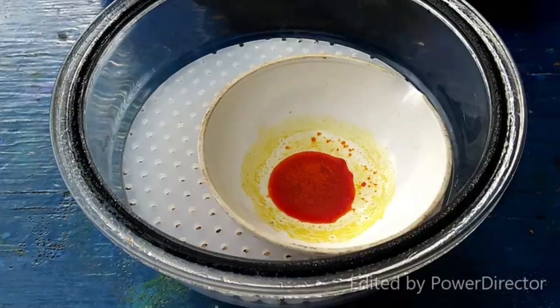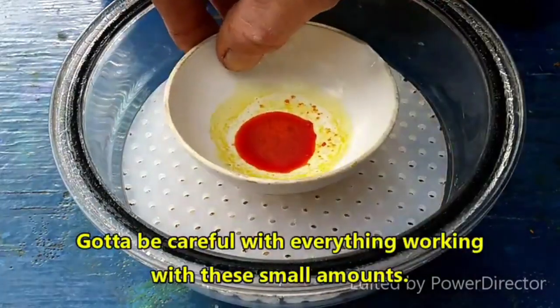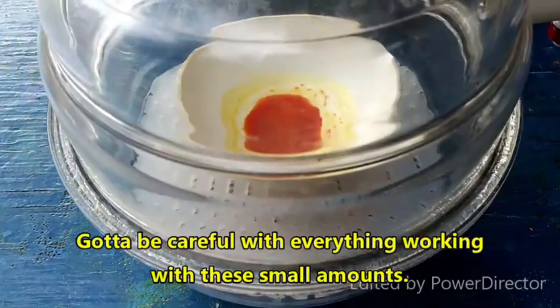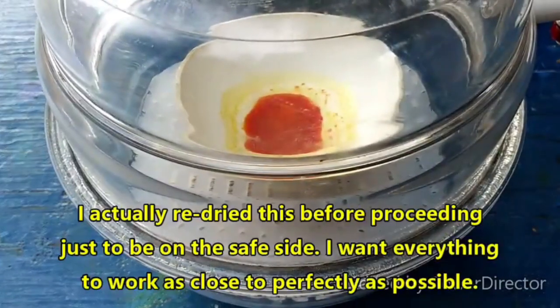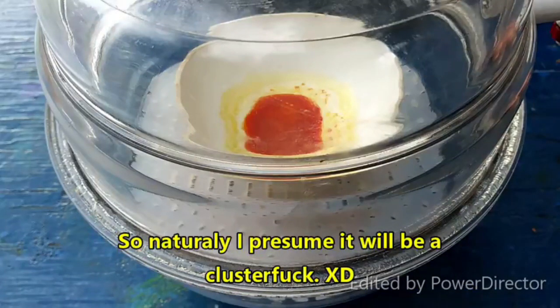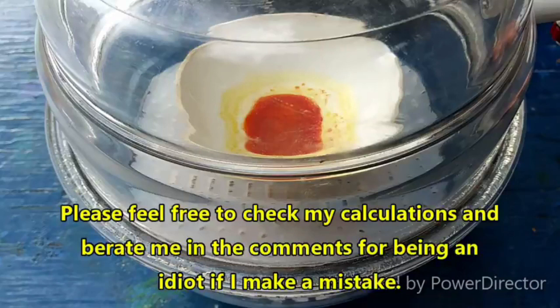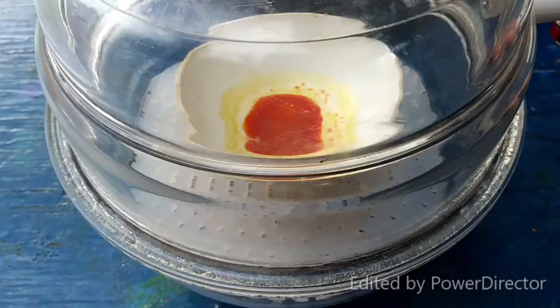I didn't store it under vacuum last night. I just put it in there so it wouldn't liquefy itself too much. So anyway, it's already doing so. Since we're working with such a small amount of material, we have to be fairly careful with everything this time because there isn't enough to try a second time. Honestly, everything has to be calculated out pretty precisely. I will show the stoichiometric calculations at the bottom of the screen, so that you can see exactly what I did. I will come back when this is dissolved and we are ready to make the first compound.